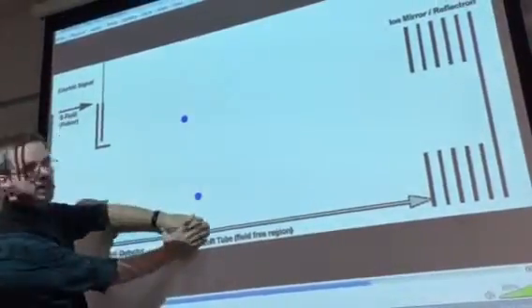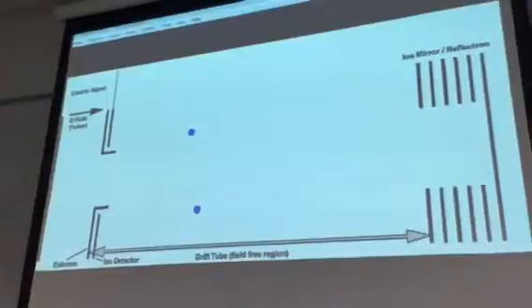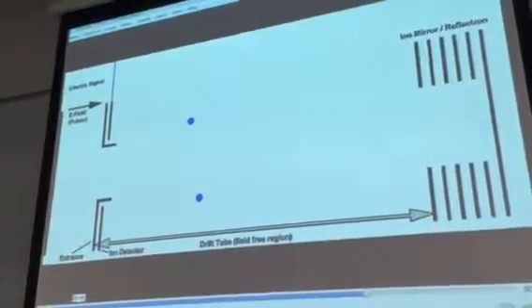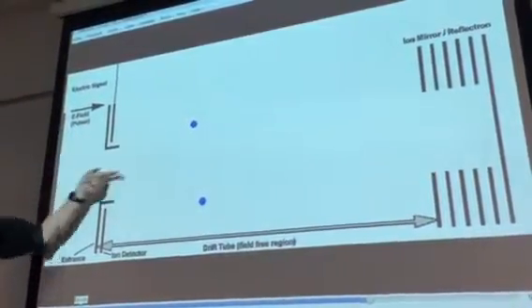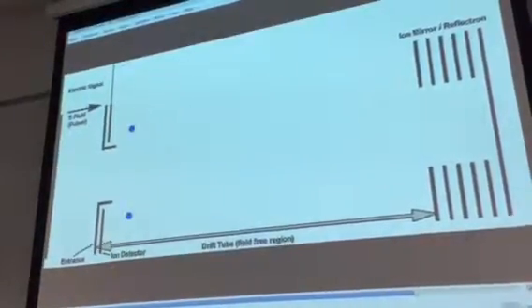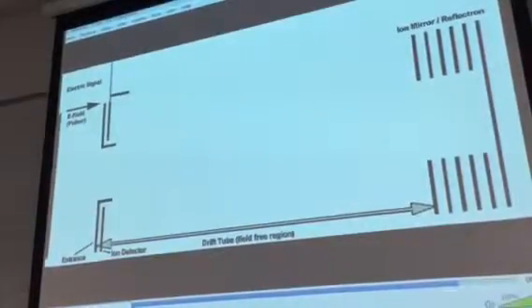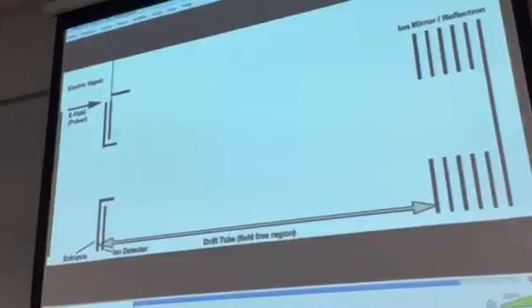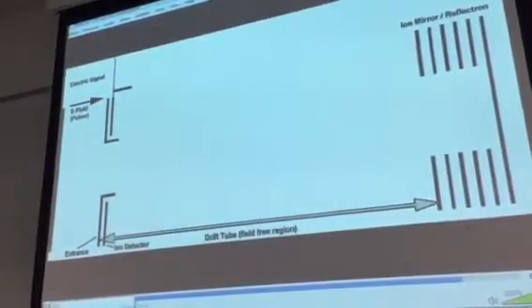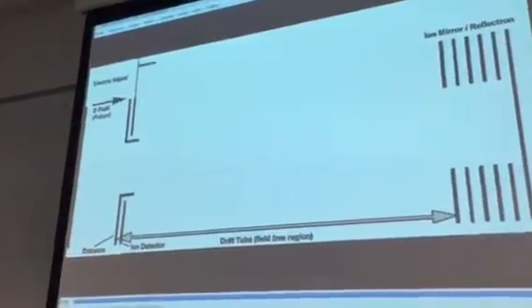They were originally more than a hand length apart, and now that's just a couple of finger widths, if you know what I'm saying. And the detector here, by the way, is on either side of this entrance slit from the ion source. So notice that when they strike the detector, there goes that little peak. It's drawn as an infinitely narrow peak, but it'll be a reduced width feature. Right? Reducing the spread of velocities, hence the width of that mass spectral feature, when you use that reflectron. Everybody good? Awesome.